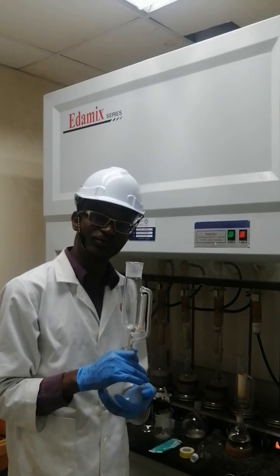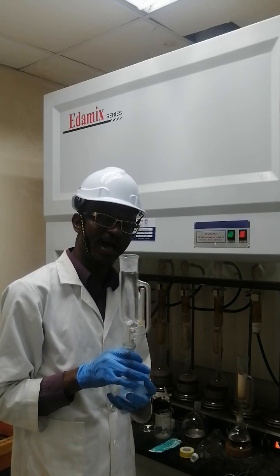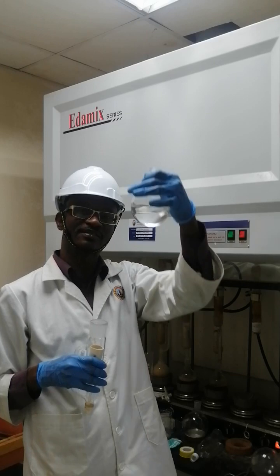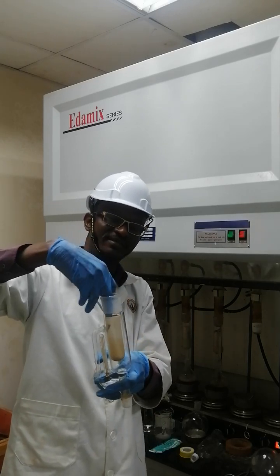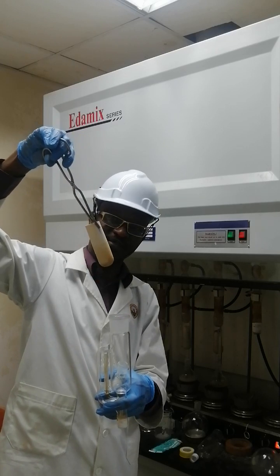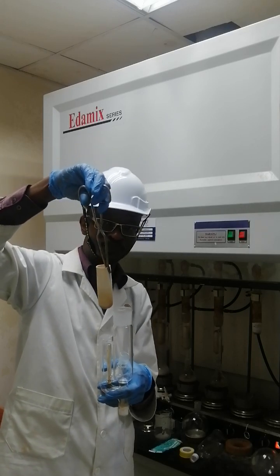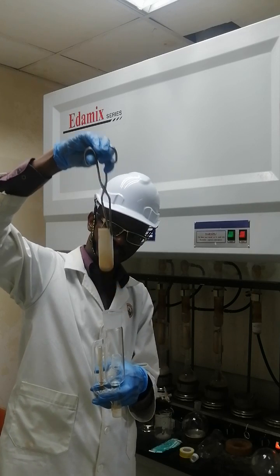So, one of the apparatus used in the laboratory is the Soxhlet apparatus. And it consists of mainly three pieces, or it's a three-piece equipment. It consists of a glass flask, the extraction chamber. This is the extraction chamber, which contains the solid to be extracted. In this case, this solid is contained in a cellulose thimble. This is known as a thimble. You can have a glass thimble as well, which has sieves at the bottom. But in the case of cellulose thimble, the solvents are permeable through the walls of the cellulose. So it does not need sieve at the bottom.